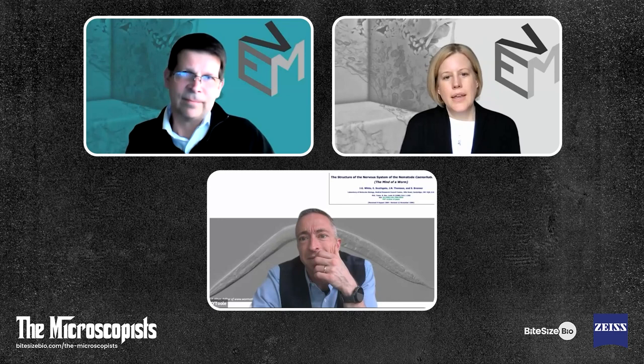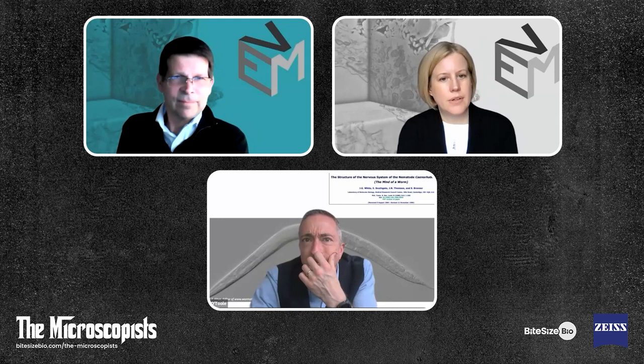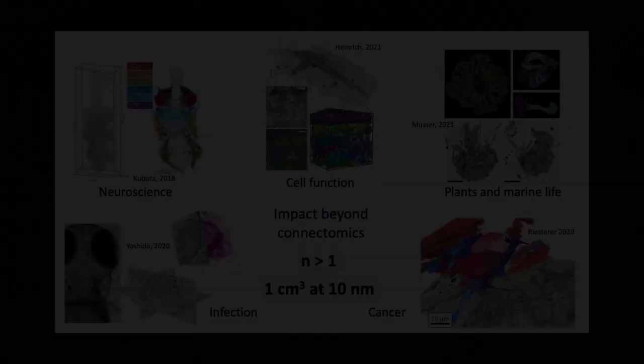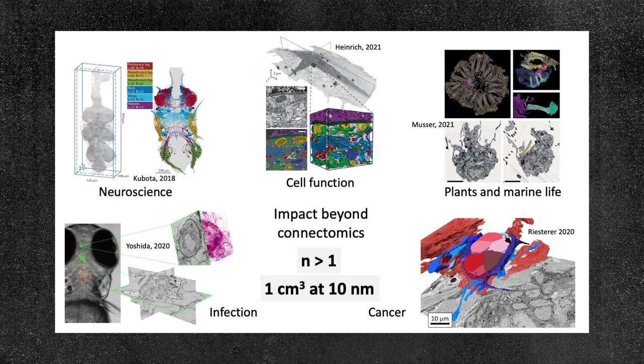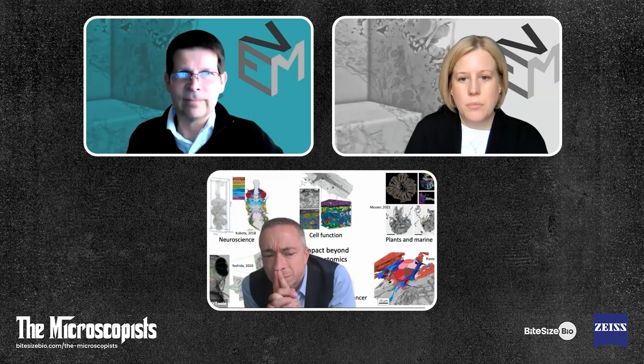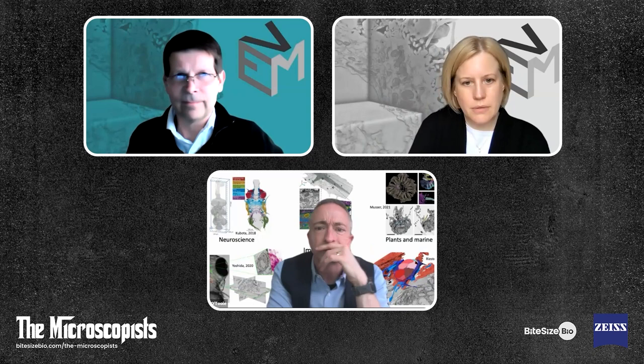And actually, we're now in the era of the mind of the fly. So there are really big groups across the world, in the US, at, for example, Janelia, and in the UK at the LMB, and many other places, gradually increasing the volumes that can be imaged and, even more difficult, reconstructed and analyzed. And what we're seeing now is that the techniques are not just used in neuroscience, but the increases in speed and resolution and analysis are pushing out through cell biology, through plants and marine life. You've got some infectious organisms on the bottom left there, and right out into the clinic. So there's some beautiful work on breast cancer samples from patients on the right.